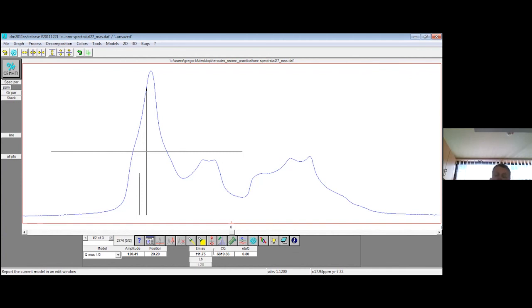You also have packages that also use DFT, but work not with crystalline or periodic models, but with single isolated motifs. So if you have a single molecule and you would like to calculate chemical shifts, you can use packages like ORCA or Gaussian or something like this. So this is another option, which is more serious and more time consuming. And then the third option, of course, is that you run additional measurements.